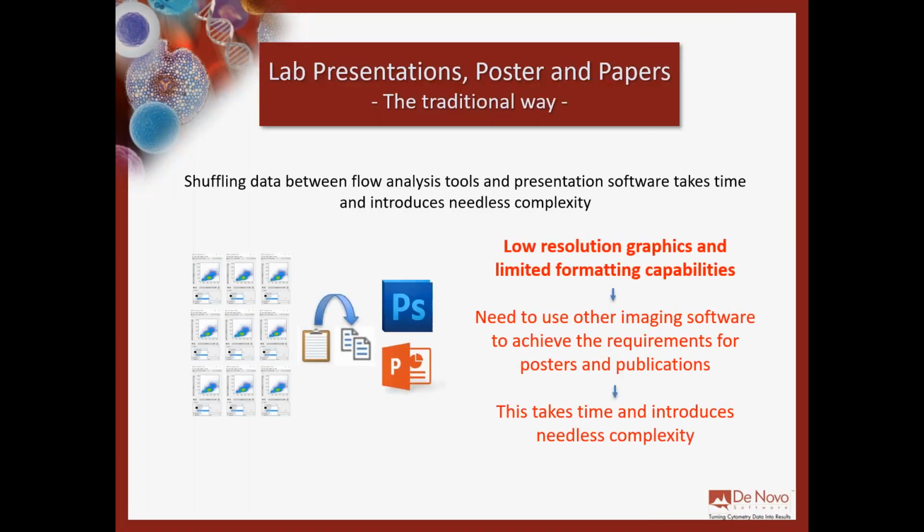So the first example is what you need to do when you want to share your data, like when you want to present your data. For example, this may happen for an informal lab presentation, for a poster, as I mentioned before, for a congress, or even when you want to create a nice and very cool picture for a publication.